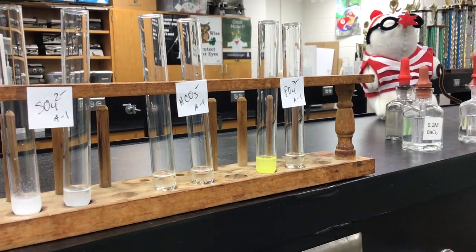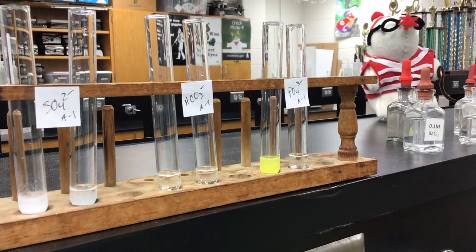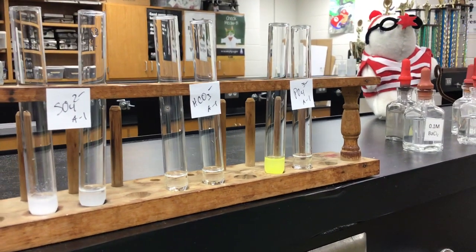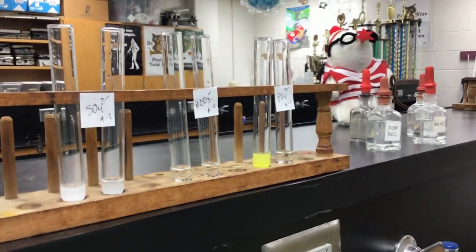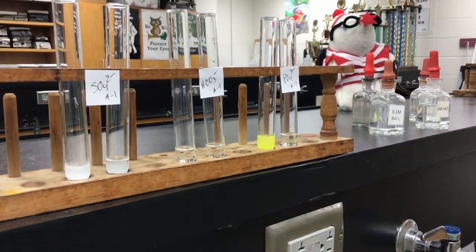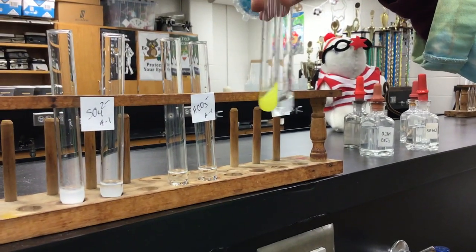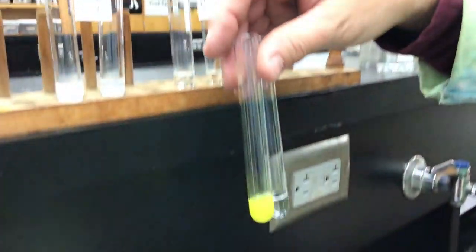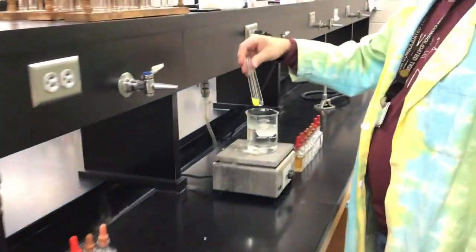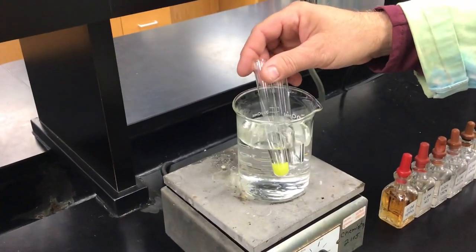And then in this one, if you didn't actually see a reaction, I believe in the lab it tells you to heat it up. It says carefully observe the test tube, 1 drop at a time. Flick the test tube to mix it. If nothing happens right away, heat in a warm bath for about a minute or so. So I'm going to take these two. I don't see a reaction happening right away. I'm flicking the test tube there. I don't see anything happening. So I'm going to take it over here to our warm water bath and place it in here for a little bit and see if we see anything happening.